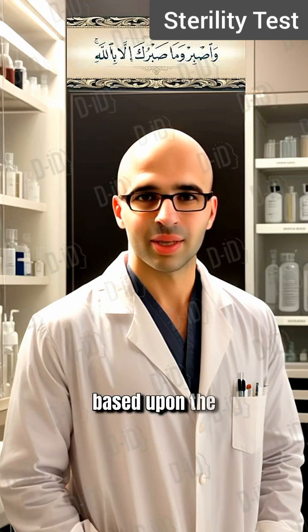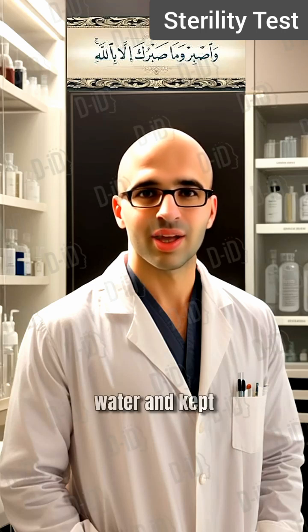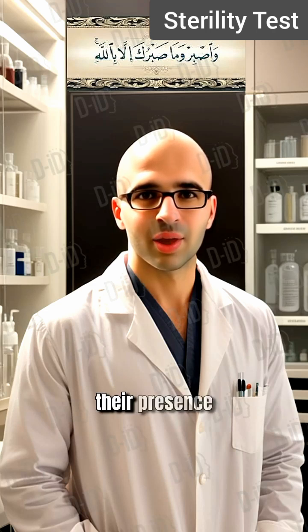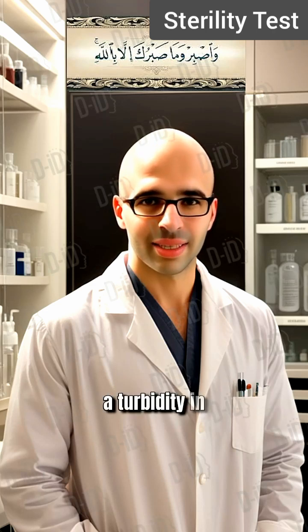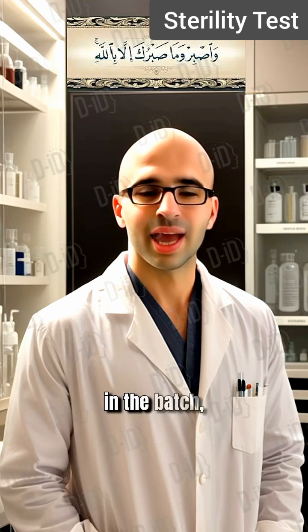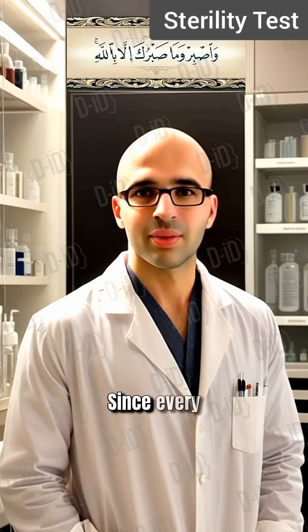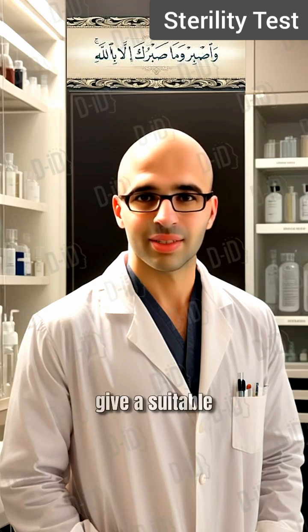Bandages, surgical dressings and devices, needles. These tests are based upon the principle that if microorganisms present in the sample are placed in a medium which provides nutritive material and water and kept at a favorable temperature, the organisms will grow, and their presence can be indicated by a turbidity in the originally clear medium. The interpretation of results is based on the assumption that the contents of every container in the batch, had they been tested, would also have given the same results. Since every container cannot be tested, a sufficient number of containers should be examined to give a suitable degree of confidence in the results of the tests.